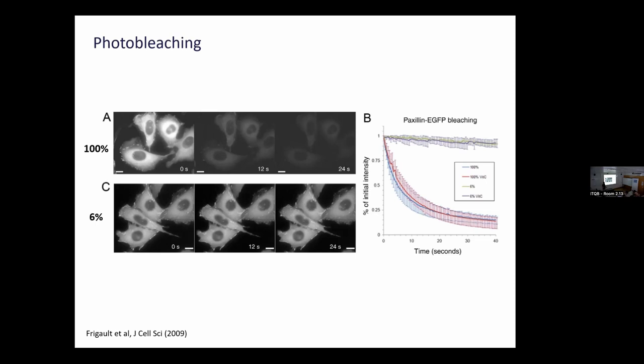So if you use too much light, if you're lucky, you have just photobleaching, but it also induces photodamage, as I've shown you before. And if you have photobleaching, you won't be able to image the cells for long. So photobleaching is something that we absolutely avoid and try to minimize when we do live imaging. And this means using the AOTF, lowering the transmission of the laser to 10%, 2%, 0.1%. In the spinning disk, we're imaging with 0.1% transmission of a laser that is even weaker than it was 10 or 15 years ago, to avoid photobleaching and also to increase the speed of acquisition.